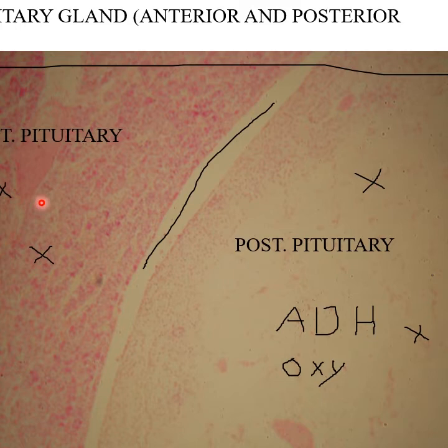You've got prolactin, which targets the mammary glands, as well as the gonads. And let's see, there's one more in there. Oh, something called ACTH, adrenocorticotropic hormone, targets the adrenal cortex. And that, of course, is also a tropic hormone. So here's one slide of the pituitary. We'll look at 1 or 2 more.